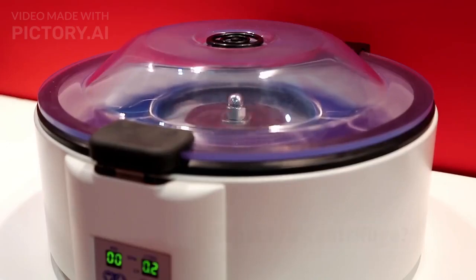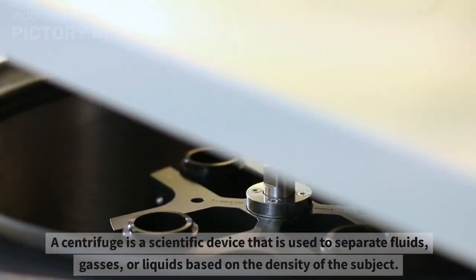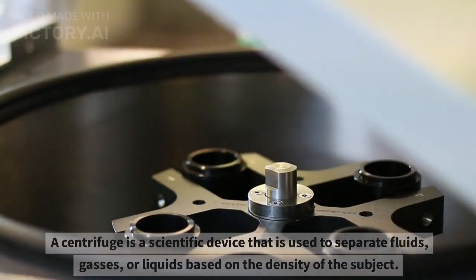What is a centrifuge? A centrifuge is a scientific device that is used to separate fluids, gases, or liquids based on the density of the subject.